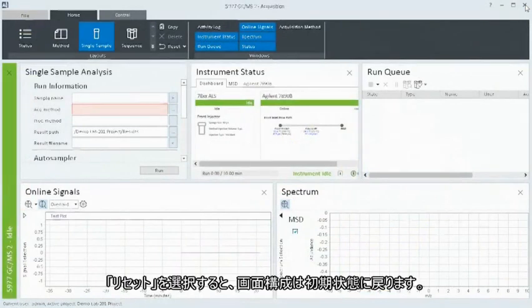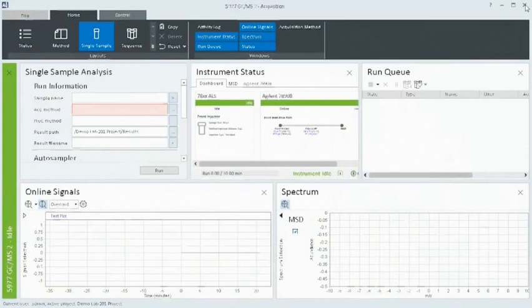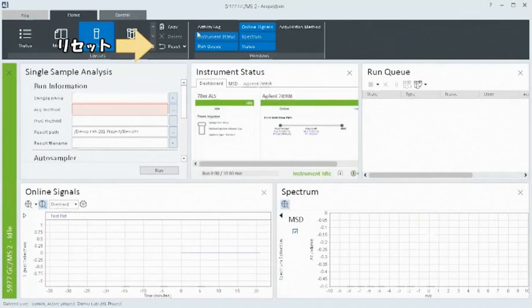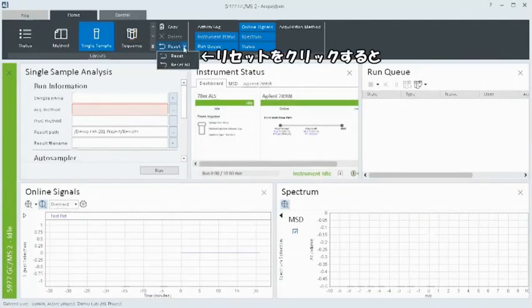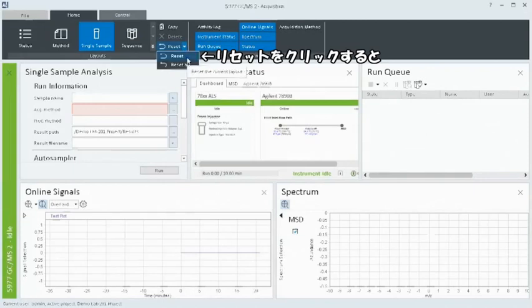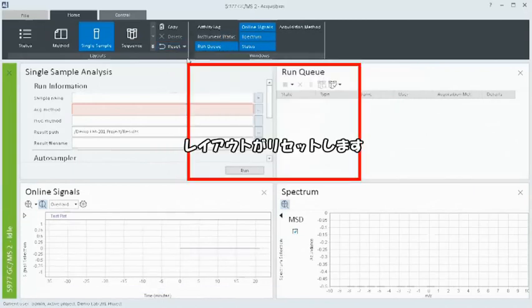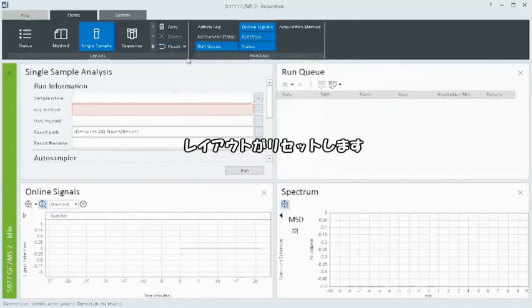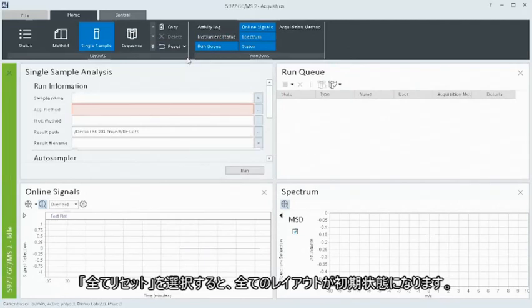Select Reset to return the selected layout to its default configuration. Select Reset All to return all layouts to their default configuration.